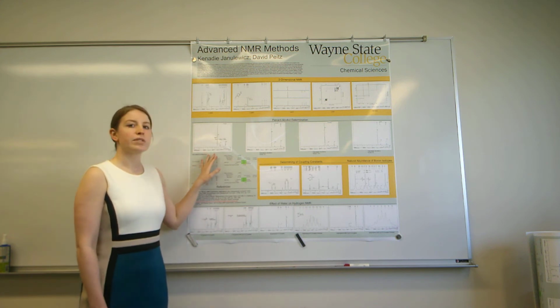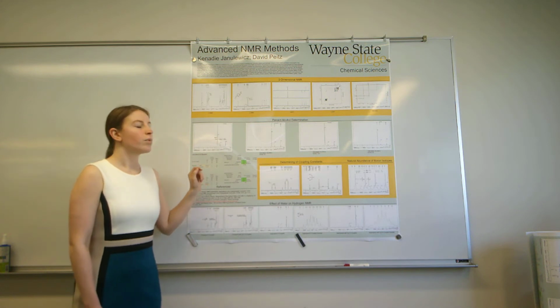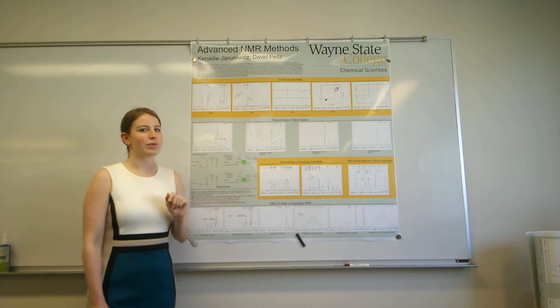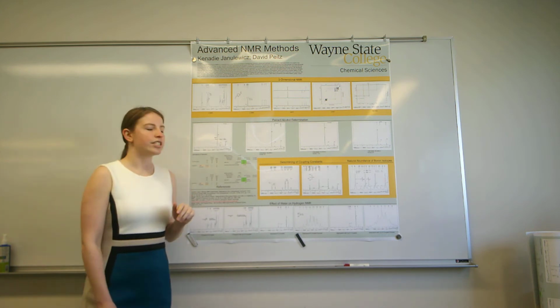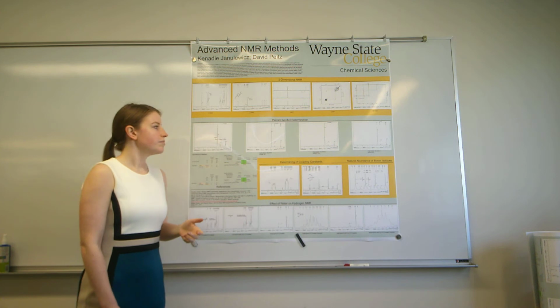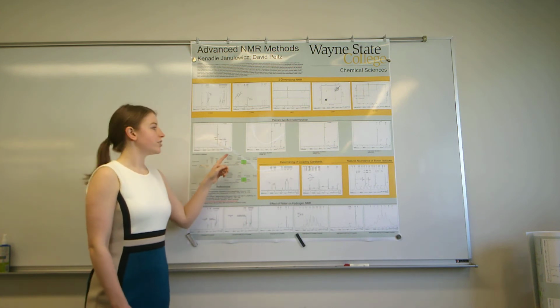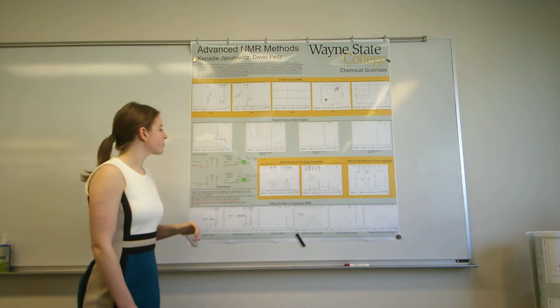Each of these spectra will be the same, with a peak for CH3 and CH2 of ethanol, whereas the water and alcohol of ethanol will be an overlapping peak. To be able to determine the alcohol concentration, we will be able to use our CH3 or CH2 peak, as they are only from ethanol. The alcohol will be a third of the moles or half of the moles, depending on which carbon peak we use.